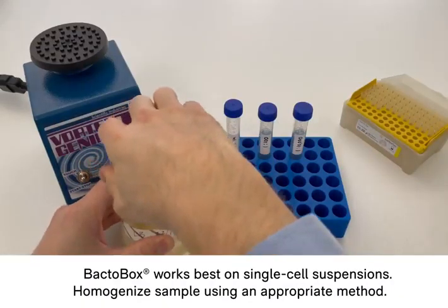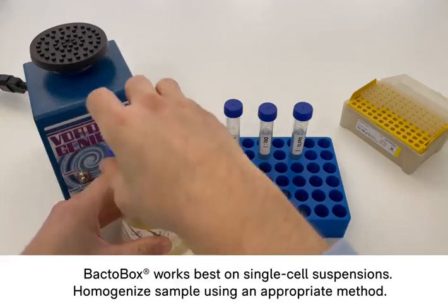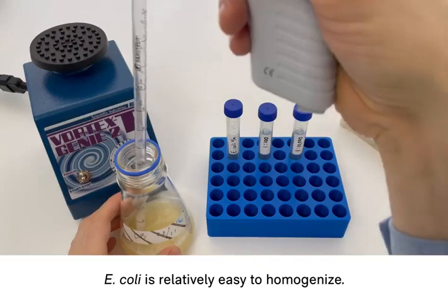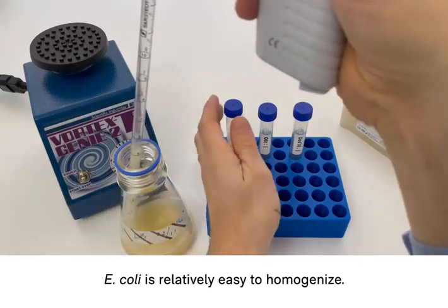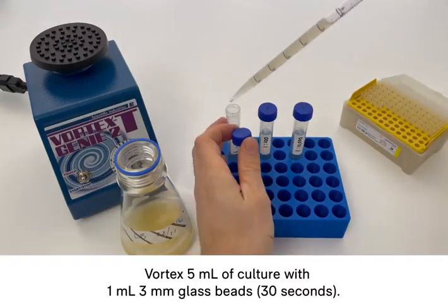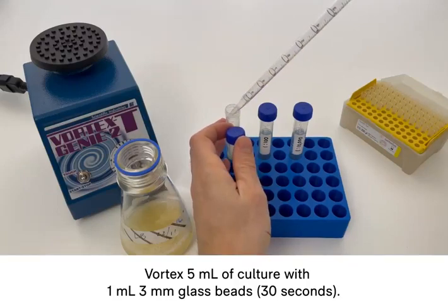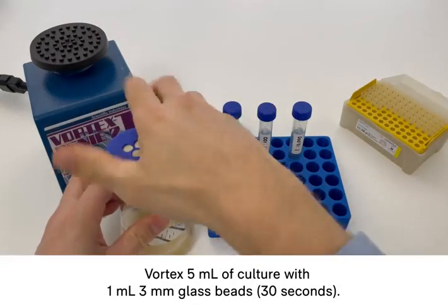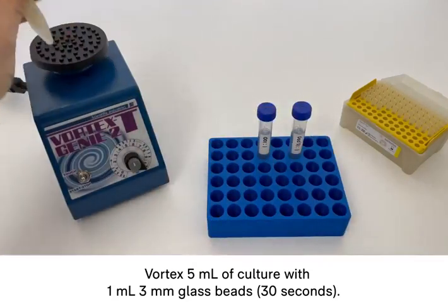Ideally we want to measure single cell suspensions and therefore we need to homogenize the sample. E. coli is relatively easy to homogenize and I do this by vortexing 5 mL of culture with 3 mm glass beads that have already been added to this tube. I do the vortexing for 30 seconds to homogenize.